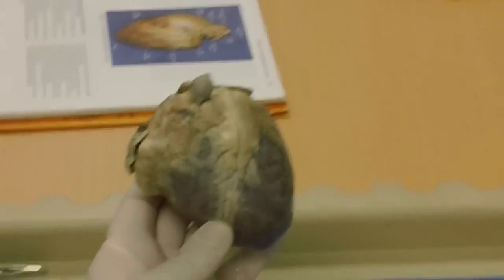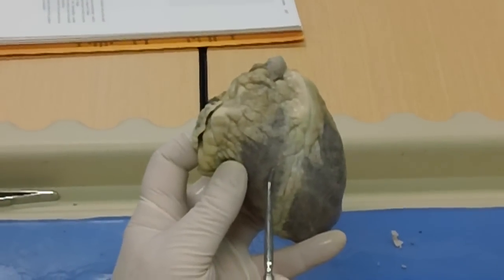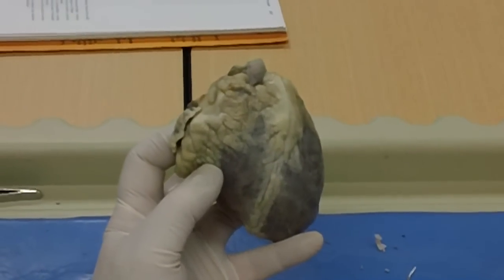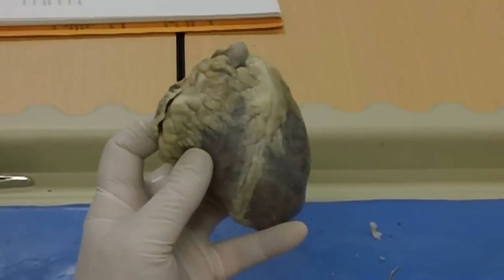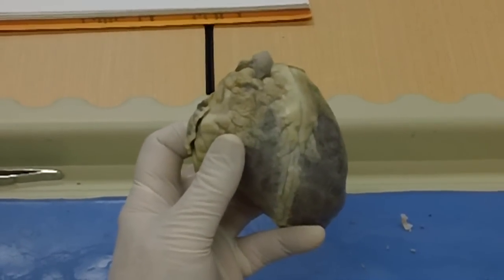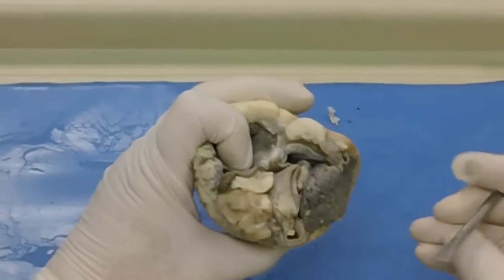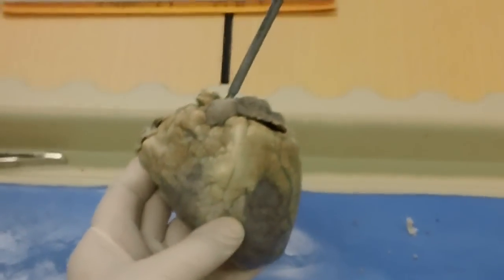So this is how this heart sits in this sheet. If this is the paraconal interventricular groove, what would that make this area? What does that word mean? Para means above, around, alongside the cone. Well, this is the conus arteriosus. So that makes this right here the pulmonary artery.